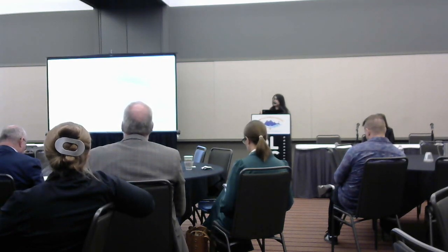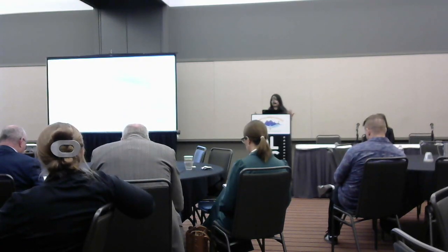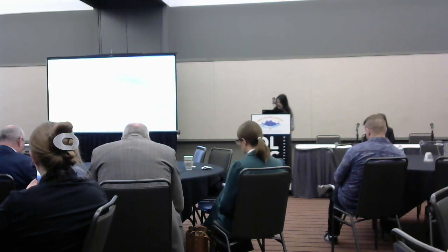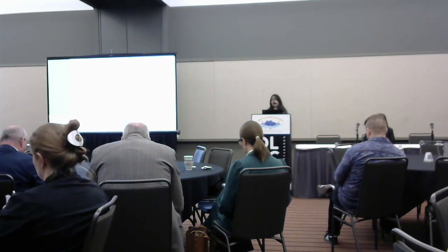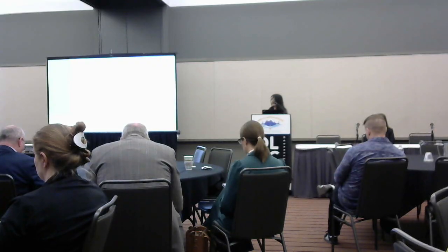But once a researcher has perfected their Python script or that CellProfiler pipeline, they often hit a wall, the desktop. So I want to tell you some of our efforts on how we have tried to scale our analysis beyond the desktop. Within our core itself, we have seen how microscopy data has exploded, both in terms of volume and complexity.